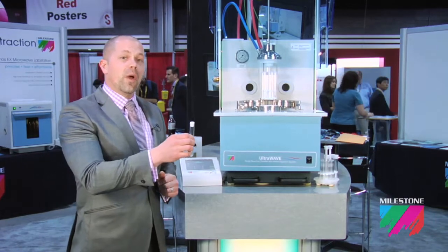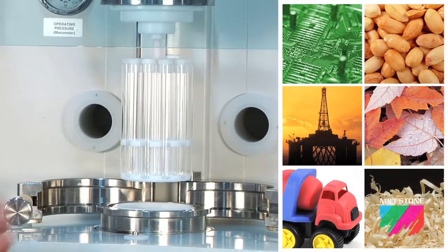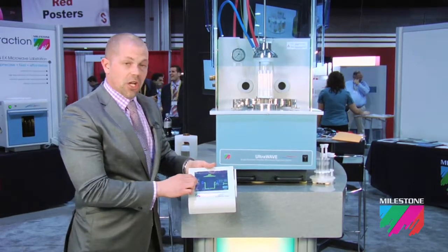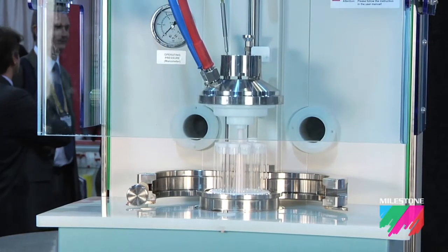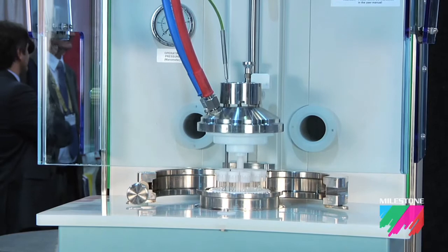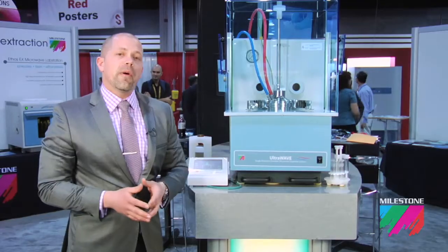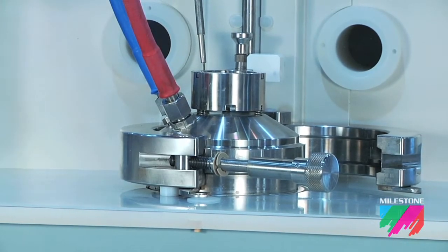Once the sample is weighed into the digestion vessel, the vessel is placed into the sample holder, and the rack is lowered into the digestion chamber at the press of a button. Prior to the start of the microwave program, we secure the rack with two stainless steel clamps.